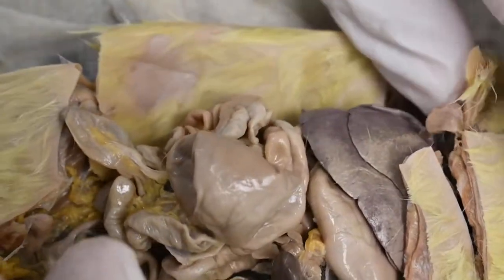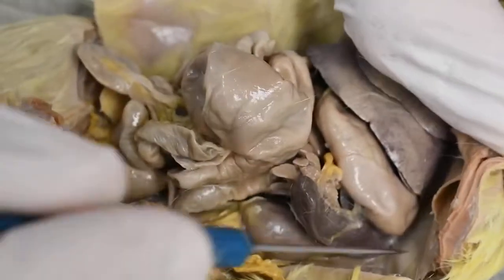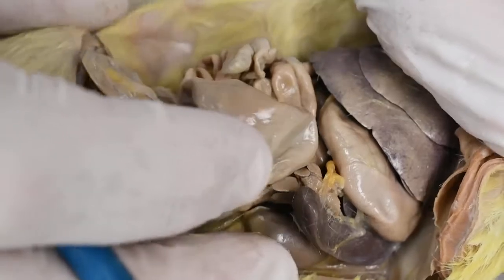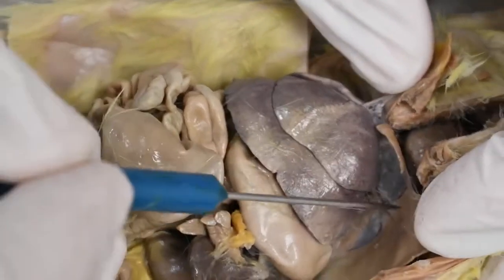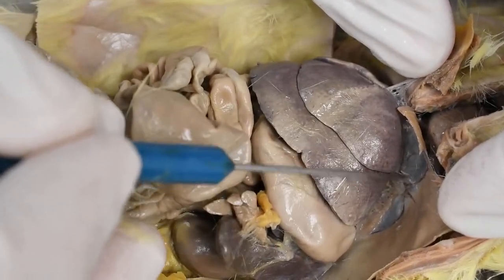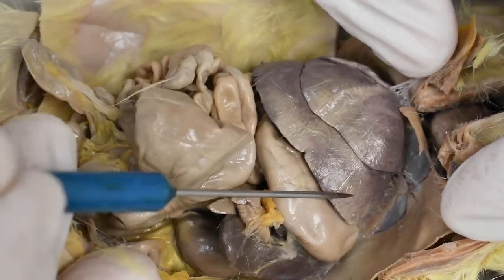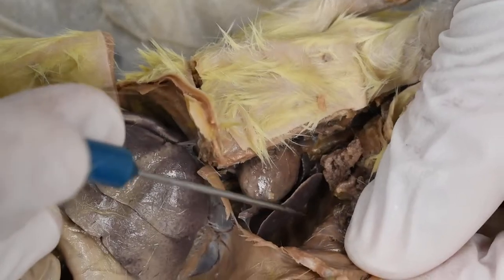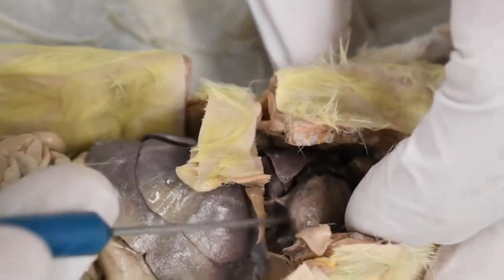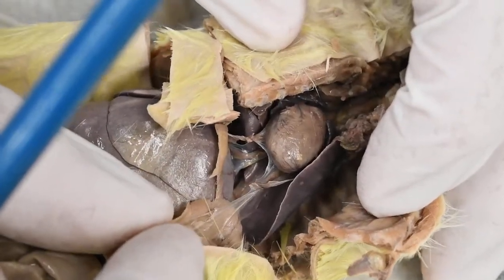So in the rat, or in mammals, the coelom has three divisions. This area here would be the abdominal cavity. And then in front of the liver, you have a diaphragm. That is this muscle here. Now you probably know the diaphragm contracts rhythmically, pulling air into the lungs. On the other side of the diaphragm, we have lungs. There are some, and then there's some more on this side, on either side of the heart. They are in what's called the pleural cavity. So the pleural cavity is in front of the diaphragm.